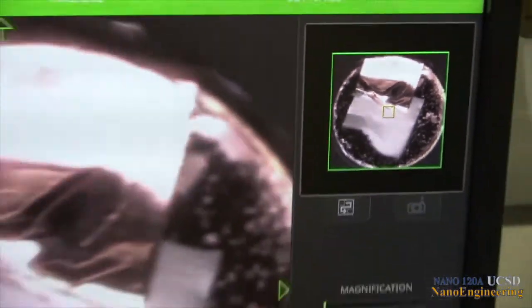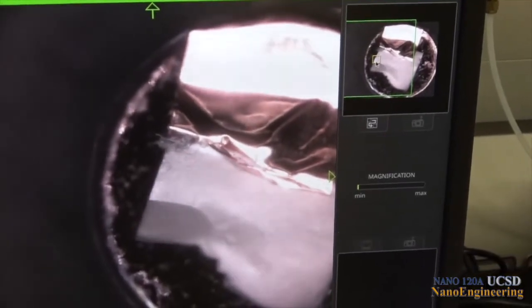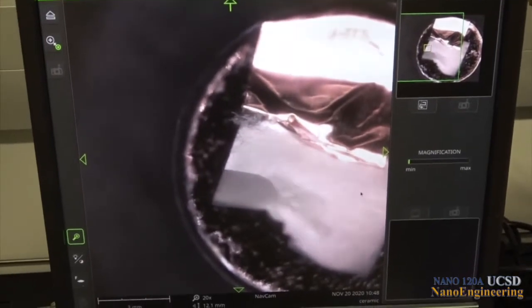Movement of the sample is controlled by clicking on the portion of the sample you want to move to the center of your viewing screen. The box in the upper right image shows the region you choose to view.